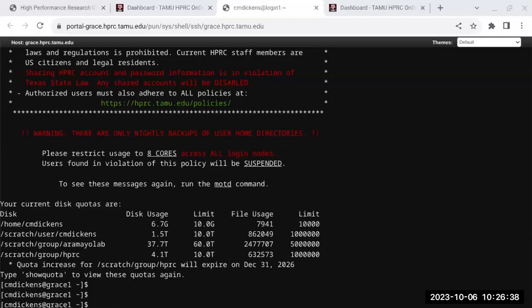If you have a 70,000 base fragment, you're not going to get as many subreads as you will from a 5,000 base fragment. So when you have a 5,000 base fragment, those reads are going to be more accurate because you're going to have more subreads to create this consensus sequence. And so this is like I mentioned earlier, these HiFi reads are going to be shorter.